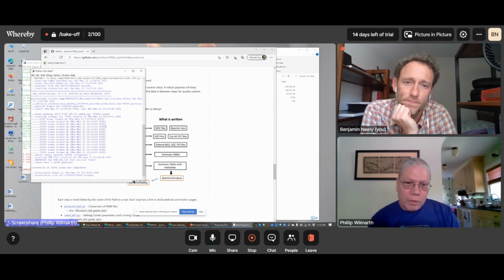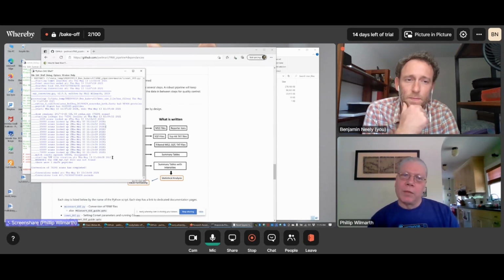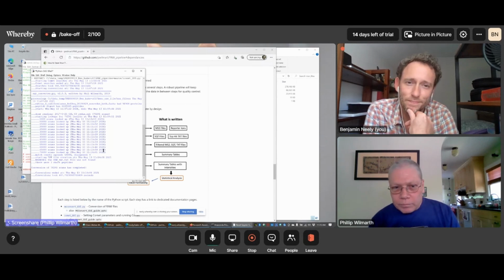The newer Comet, I think, is more explicit in its output, so I don't know if you still need to do this. I think it might explicitly list all of the matches instead of just telling you the number that it matched. So this might be somewhat tied to this a little bit older version of Comet that I need because of the way PTMs are specified. But at any rate, that's what we got, and that's how it works.